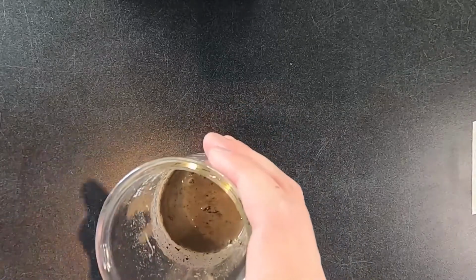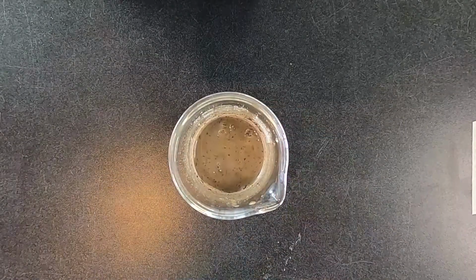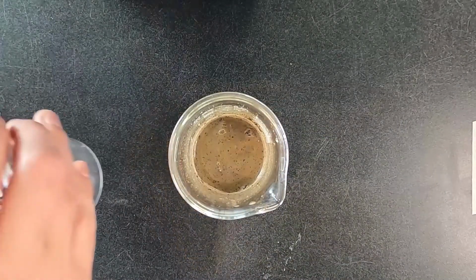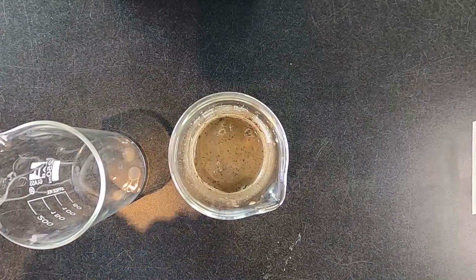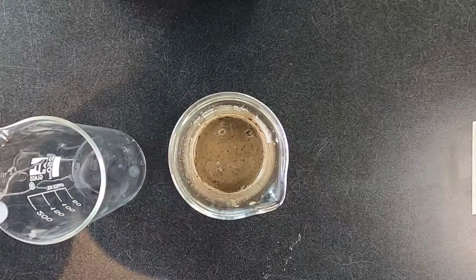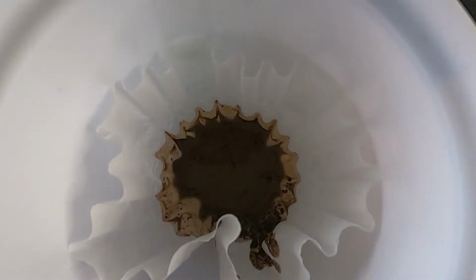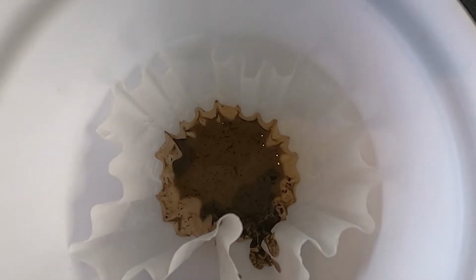All stirred up. Now is the important part. We have some mucky water here, but what we're going to do is we are going to filter this out by using a coffee filter. So I have a new beaker and I have a funnel here with a coffee filter inside of it. We're going to put that right beside it and we're going to pour all of this just into that. Now, as we give it a little bit of time, gravity is going to pull all of that water through that filter and into that clean beaker. So this takes a minute. So we're going to have to wait for all of that to drip through.